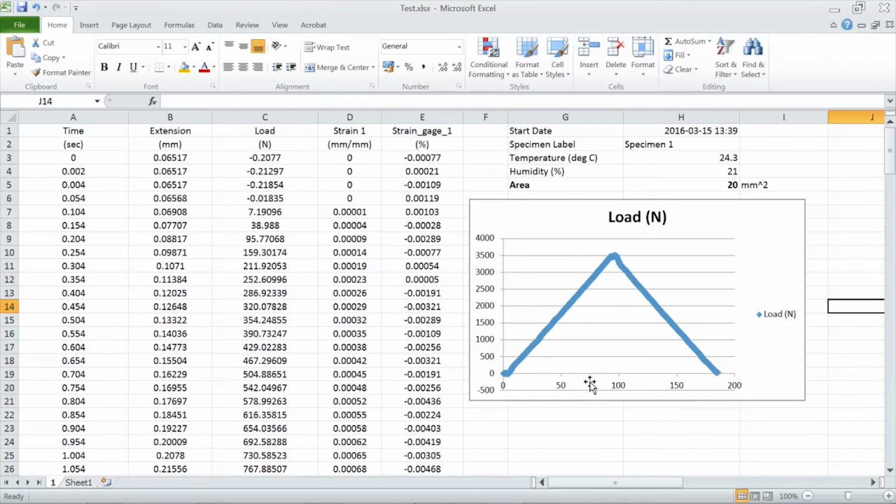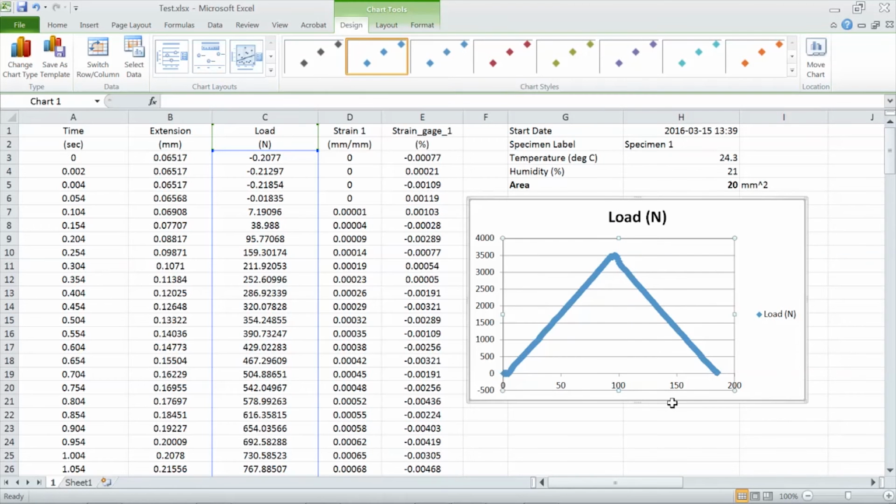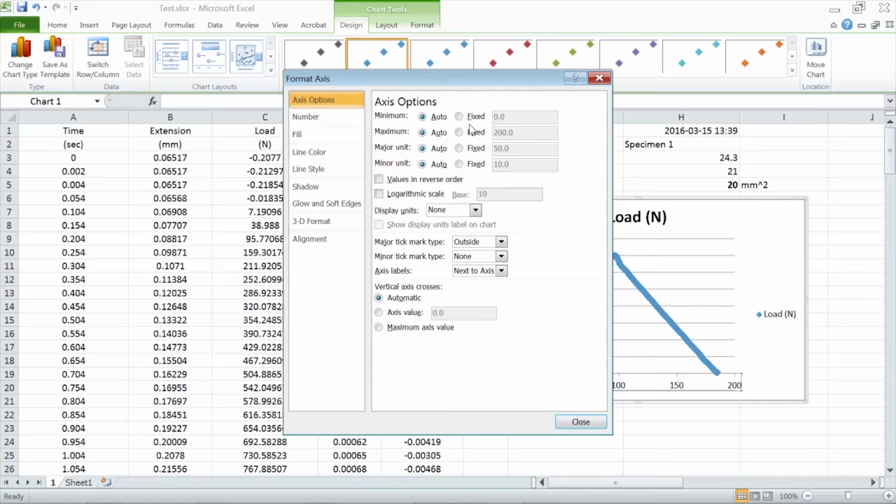You have to remove those values, because this is an artifact and you don't really want them. Let's look at the values a little bit closer. Let's look at the first 20 points only, and you will see what I mean.